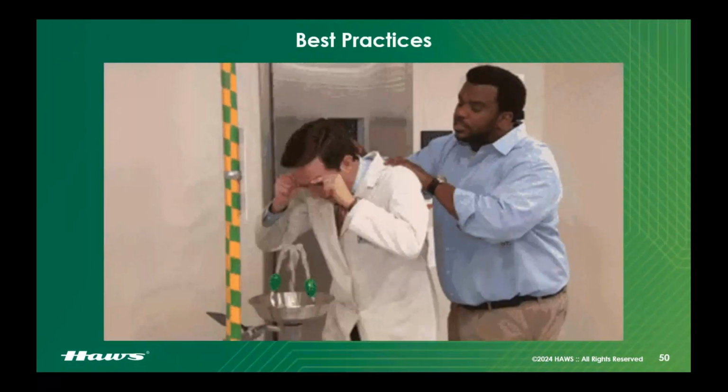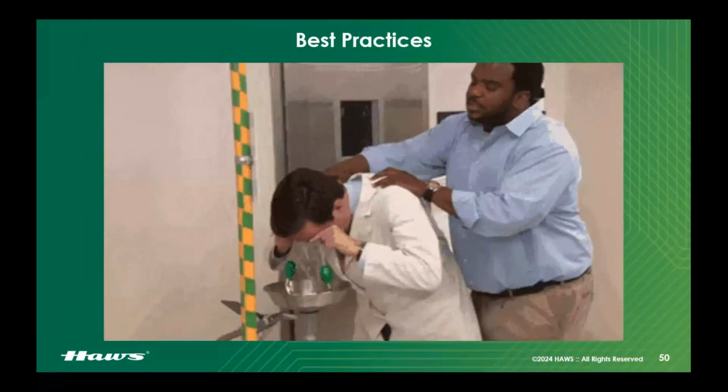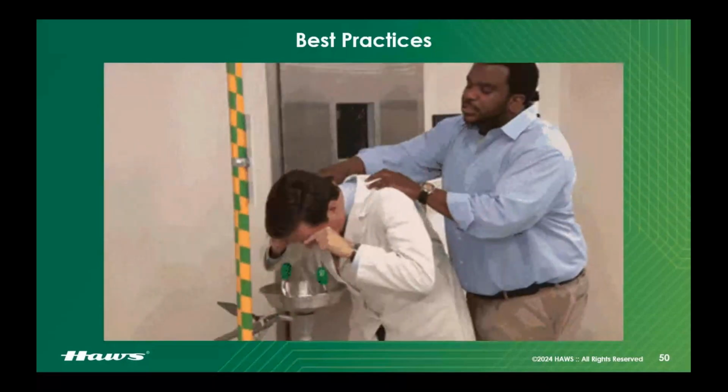I like this clip just because you might recognize the Nard dog there from The Office, but his technique is excellent. He's really dug his fingers in. His eyes are wide open.